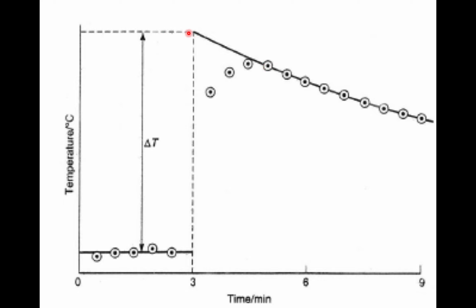And what you're actually going to use for delta T is this bottom line, the distance between it and where this top line hits. You use this to compensate for something that's called thermal temperature loss to the room. You're losing some amount of temperature to the room as this is getting transferred out. And so you're extrapolating up to here to see where this point should be if you weren't losing this thermal energy to the room.